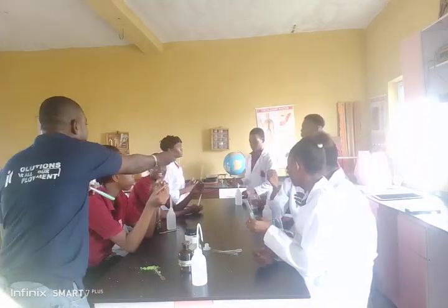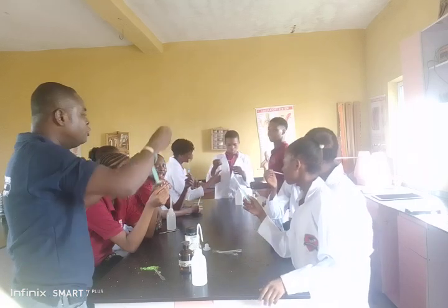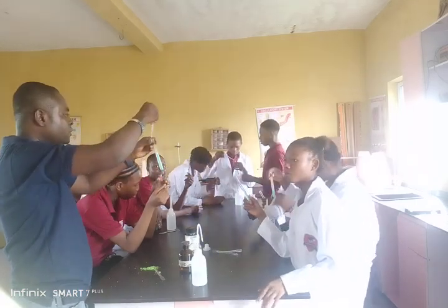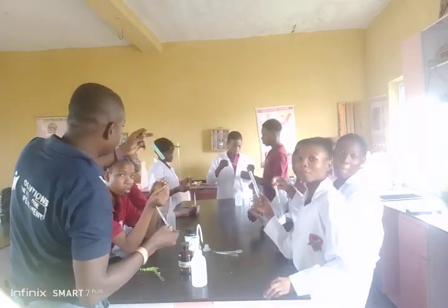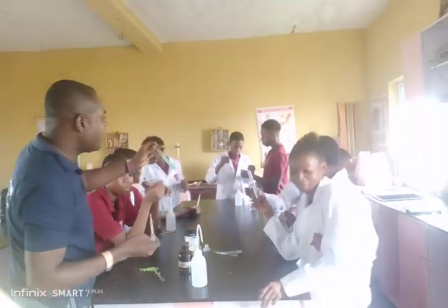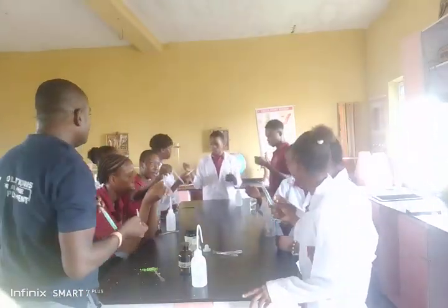This person has added in excess. That's why you are seeing deep. Just one drop. You see light blue precipitate particles there. Have we done that now? Yes. So now what has happened there?